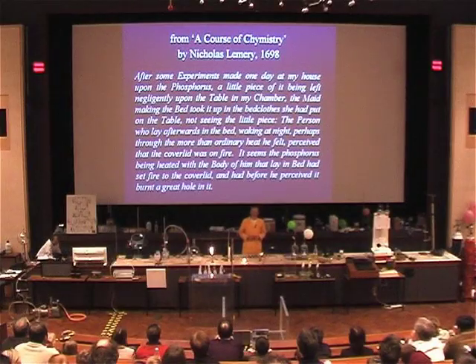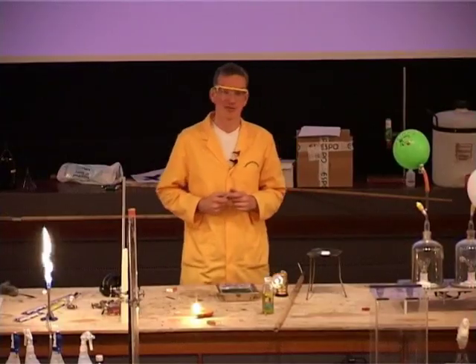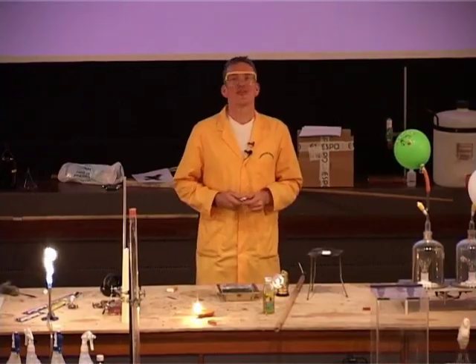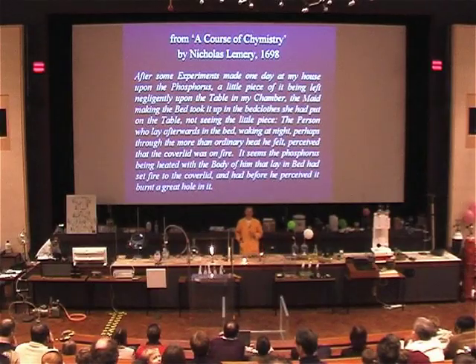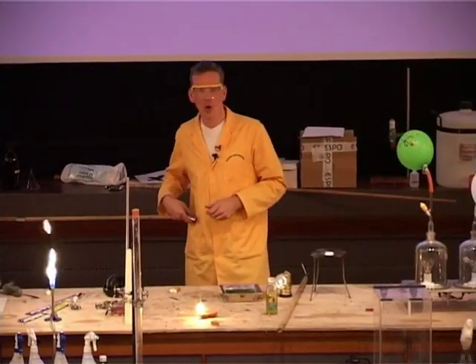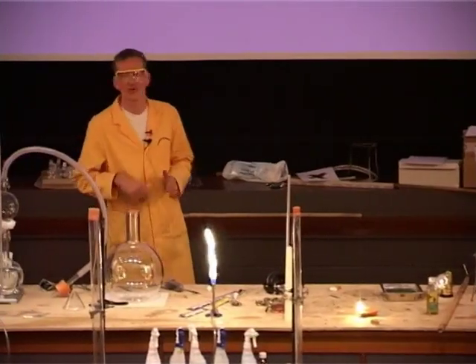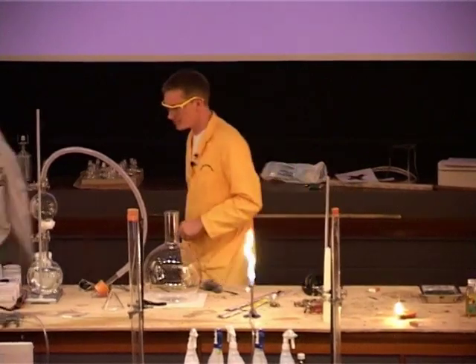The person who lay afterwards in the bed, waking at night, and I like this bit, perhaps through the more than ordinary heat he felt, perceived that the coverlid was on fire. It seems that the phosphorus, being heated with the body of him that lay in the bed, had set fire to the coverlid, and before he had perceived it, had burnt a great hole in it. Well, I thought we ought to demonstrate this to just show you how reactive phosphorus really is.